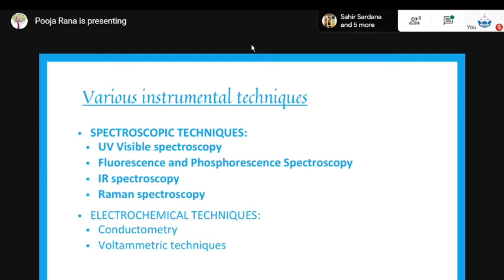When I refer to fluorescence, I need to firstly expose that particular sample or material with some external light source, and thereafter when the light hits the surface of the material, it would give out some sort of light of another color.